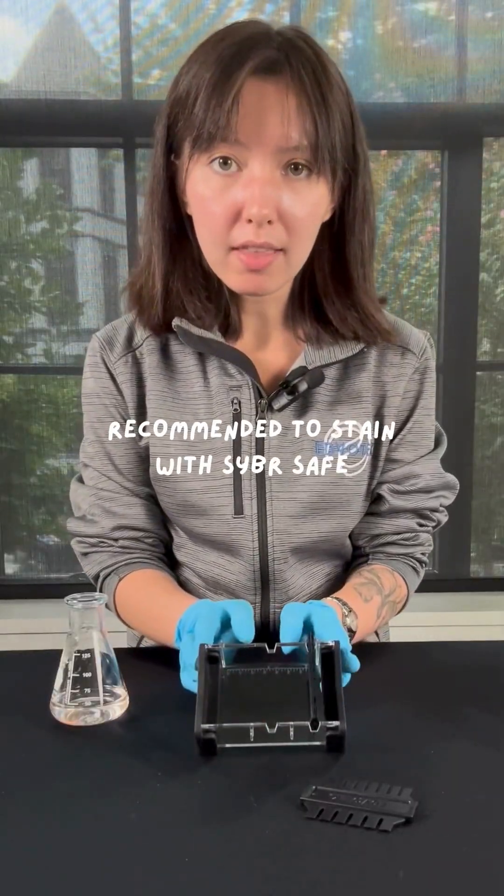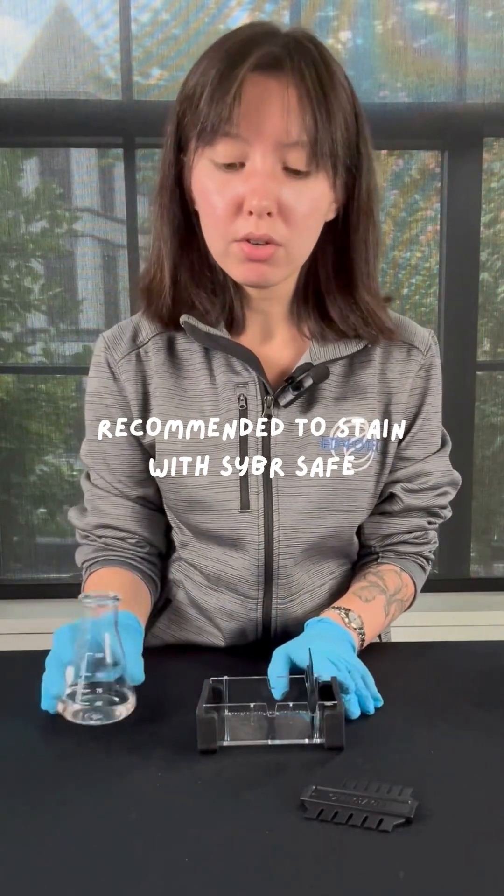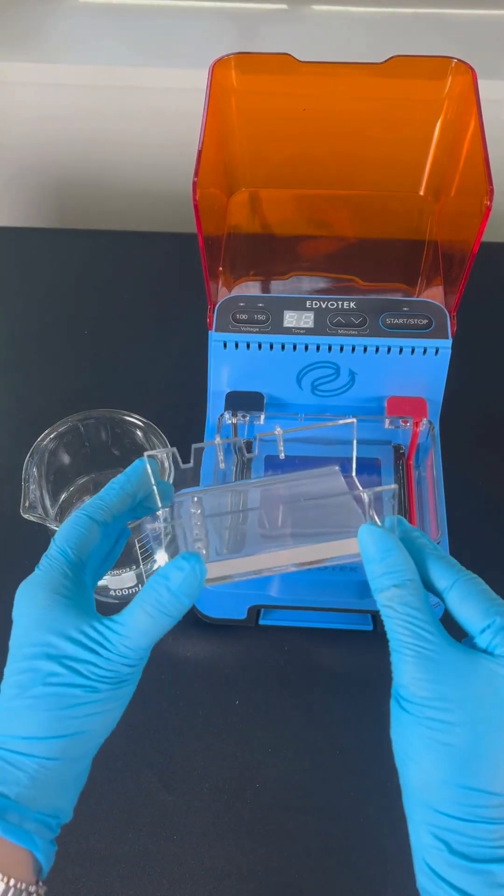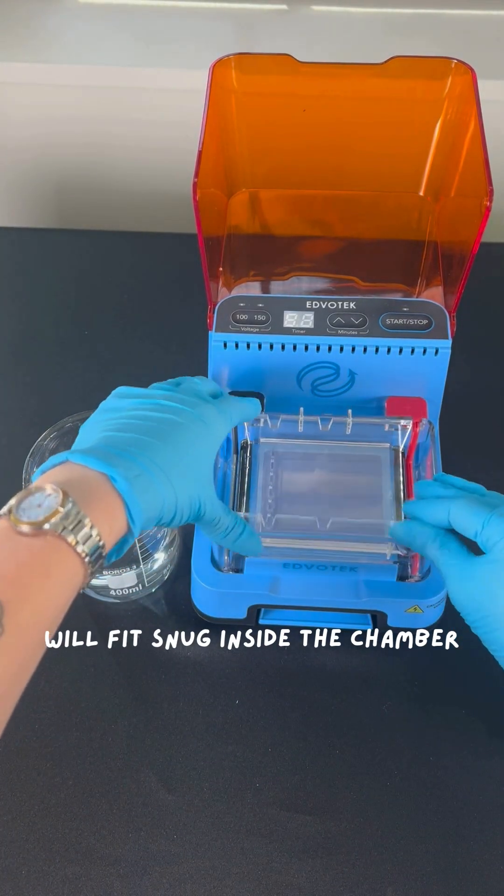We provide the combs and the chamber for you to mold your gels in, so all you have to do is pour out your gel. After you've gently removed the comb and the end caps, place this into the Edge system as so.